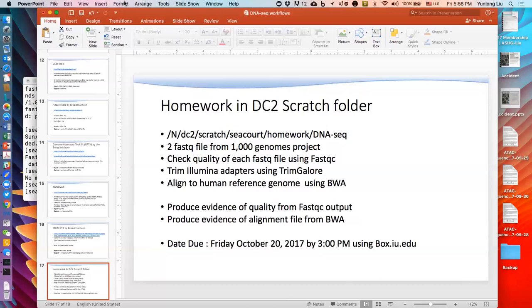Yes, and I'll tell you why. GATK is going through an issue right now where 3.7 just became 3.8, and they're in beta right now for 4.0. So their 3.7 is kind of the established norm for several years now. 3.8 was a newer release, but with 4.0 coming out in beta, my recommendation, just from past experience, is to move with trepidation before you move into 4.0.